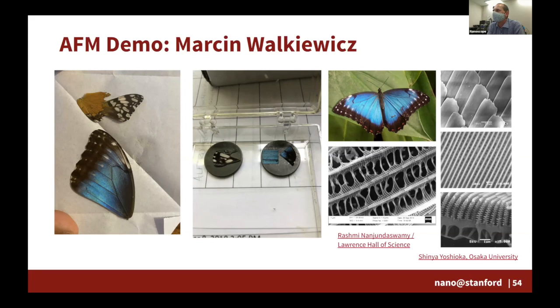But I also want to show you, just for context, what we're looking for. The structural colorization is because of this nanostructure that's going on. The wing is made up of these little plates, I would call them. If you zoom in closer on the plates, you'll see these little bumps here, and they're called lamella. And if you did a cross section of that material, you can see the structure.